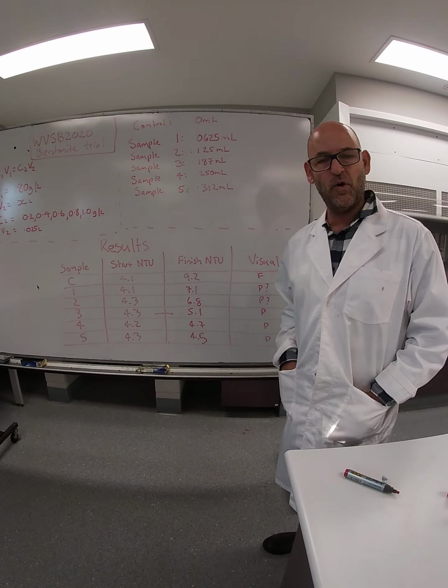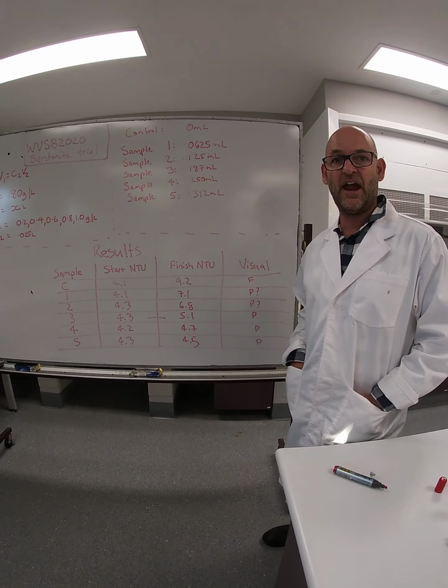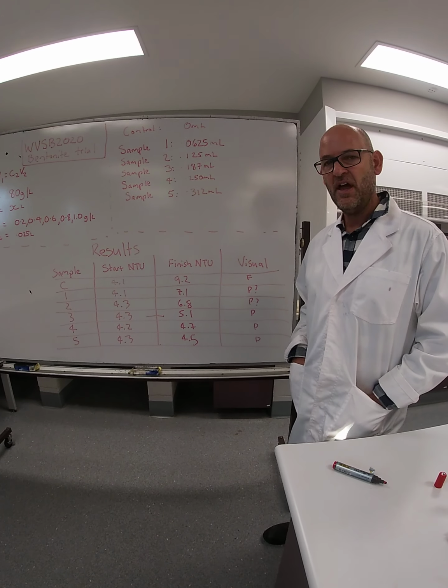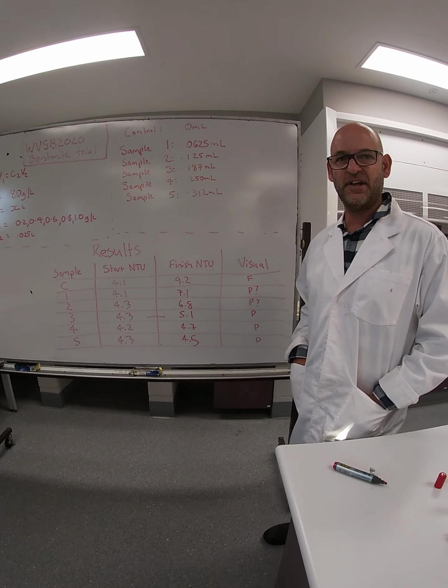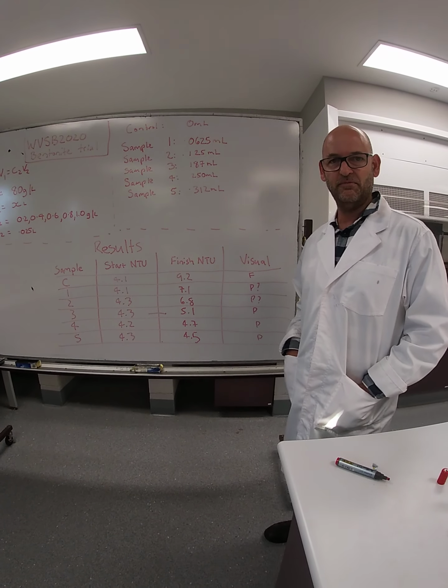Okay, so thanks for partaking in today's prac. We're still hoping that there'll be an opportunity for you to carry out this prac on campus very soon. But until then, hopefully you've gained some theoretical understanding of how bentonite fining works in reality. Thank you.